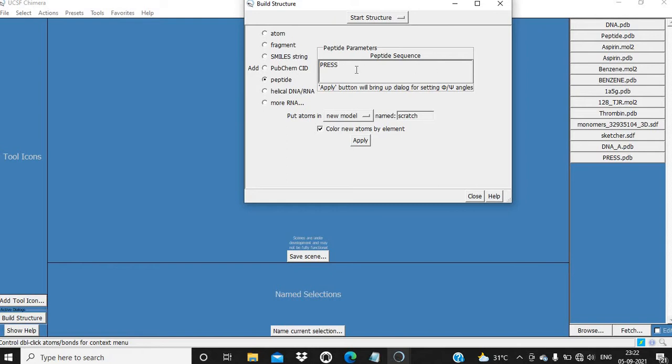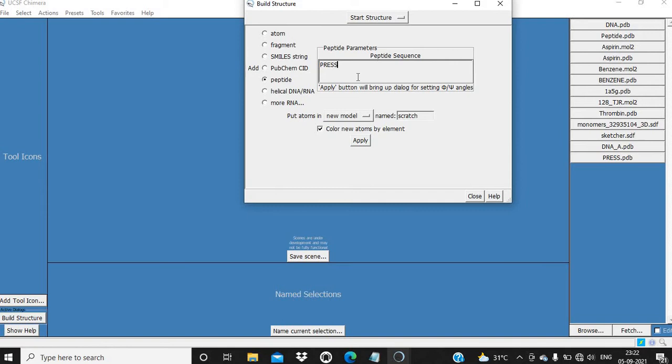It will have PRESS, which means proline, arginine, E for glutamate, S for serine, S for serine - so total five residues. I am going to name it as test and then apply.